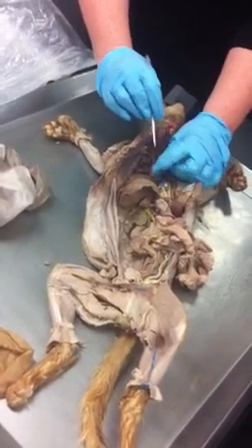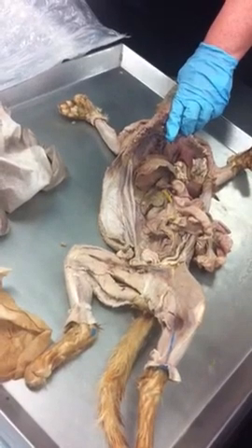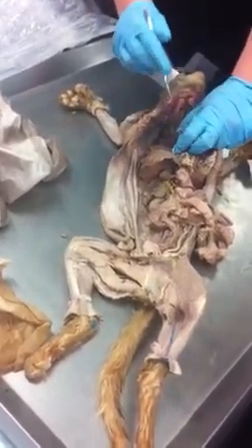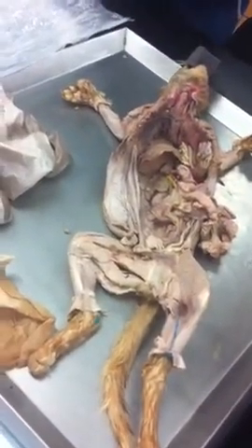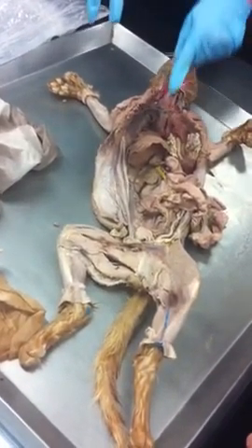So the trachea comes down, branches to go to the two lungs. What is that structure after it's branched? What's that called? Yeah, so just imagine this is the trachea and I branch. What are these two branches called? Going in, primary bronchi.